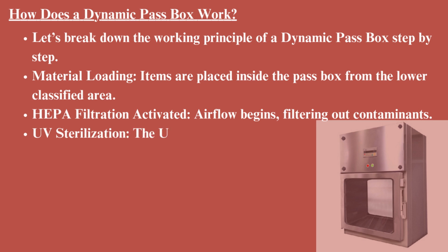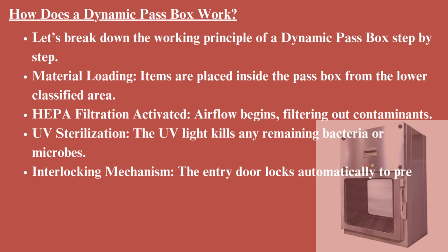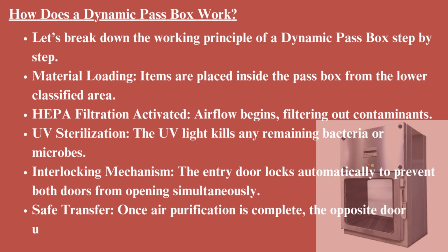UV sterilization. The UV light kills any remaining bacteria or microbes. Interlocking mechanism. The entry door locks automatically to prevent both doors from opening simultaneously. Safe transfer. Once air purification is complete, the opposite door unlocks, allowing material transfer.